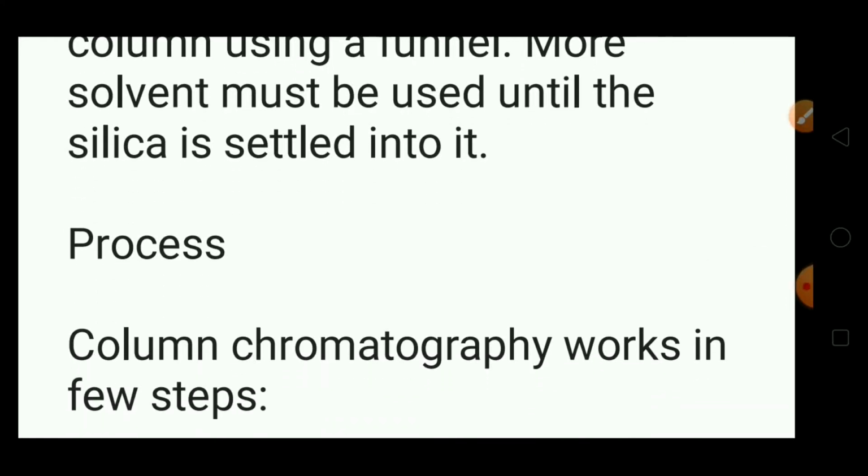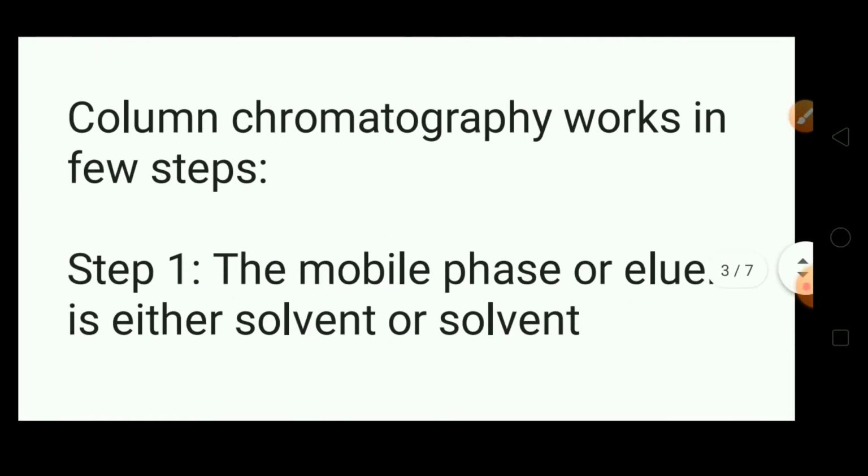Now its process. I will explain it to you in 4 steps. Column chromatography works in 4 steps. First is step first.